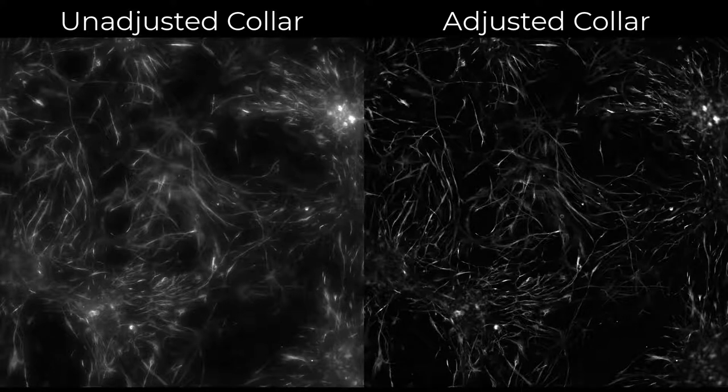As you can see, the corrected image is sharper and clearer, making this a vital adjustment for the microscope. Without doing this adjustment, you are not taking full advantage of your microscope's capabilities. We recommend doing this adjustment every time you use the objective — this ensures that you have optimal image settings.